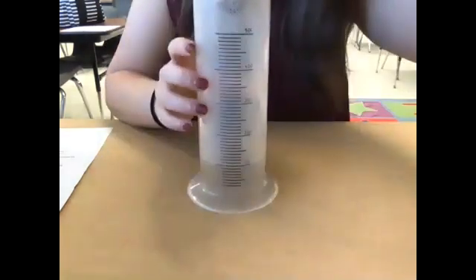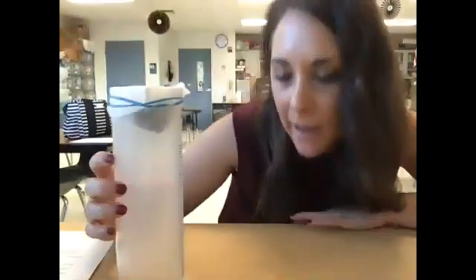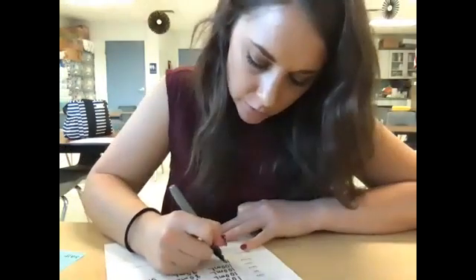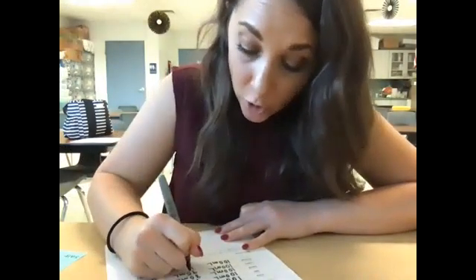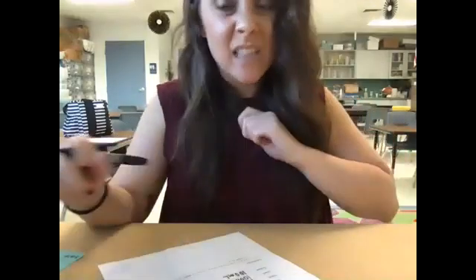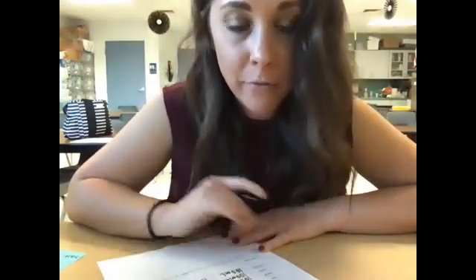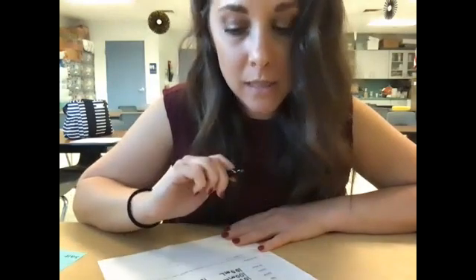All right. So when I read my graduated cylinder now, 100 milliliters of water are in the graduated cylinder. Whoa. So let's think about this. I started with 100 milliliters. There are 100 milliliters in the graduated cylinder after 2 minutes. That means the gravel is not holding in any water. There are 0 milliliters of water in the gravel because 100 minus 100 equals 0.